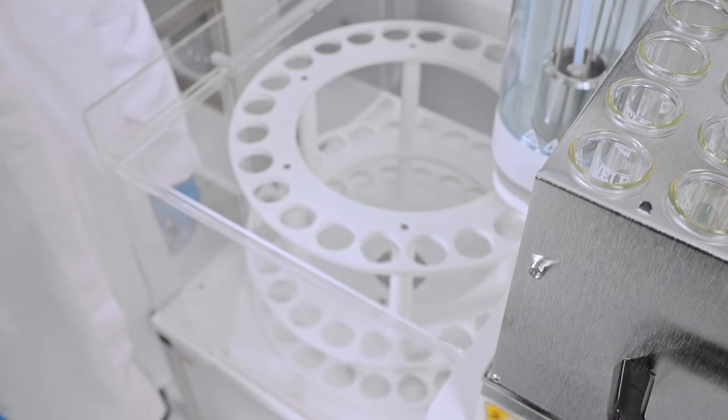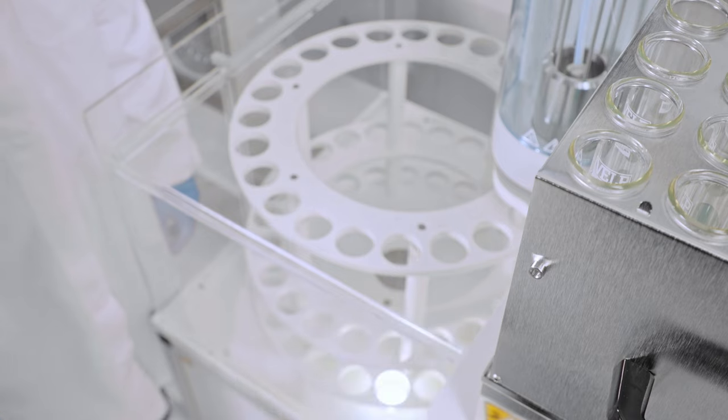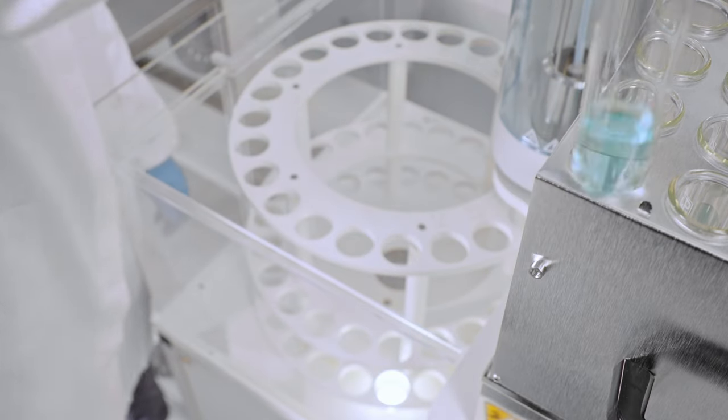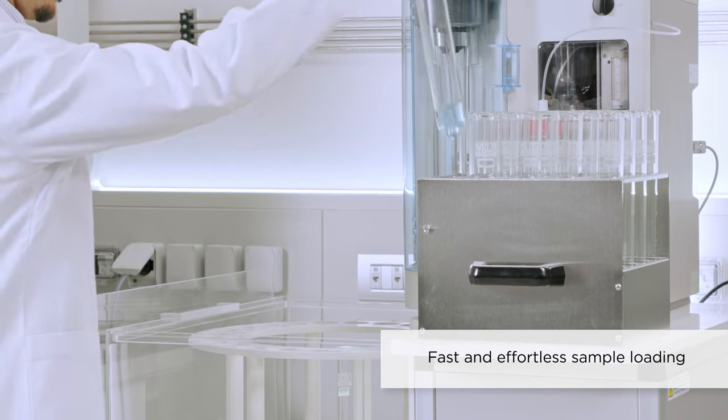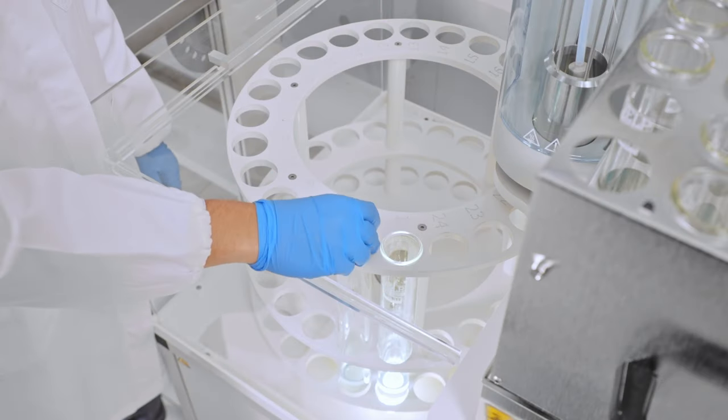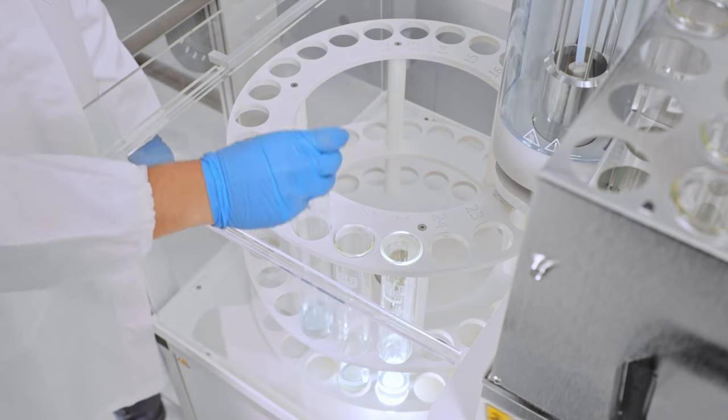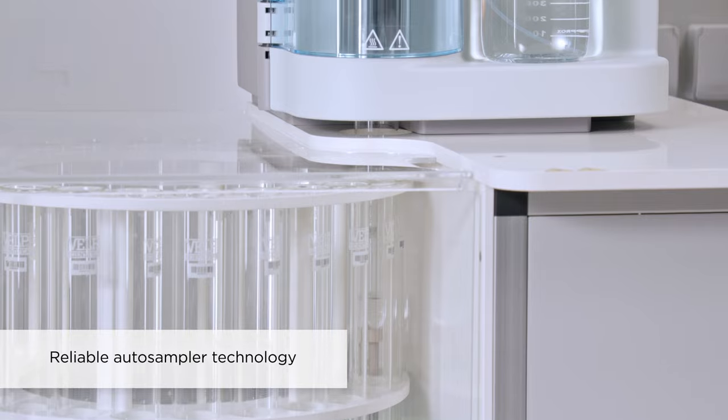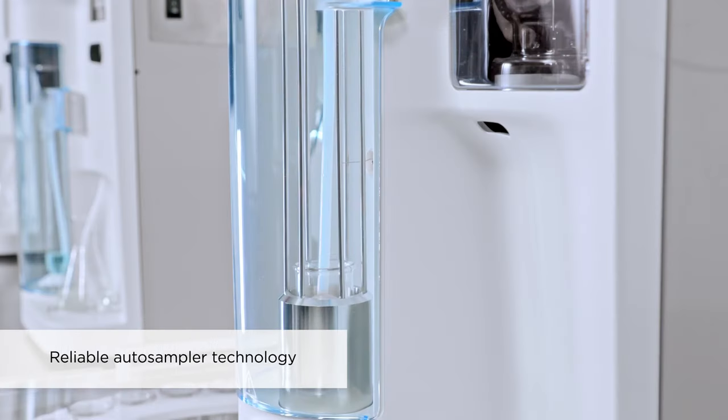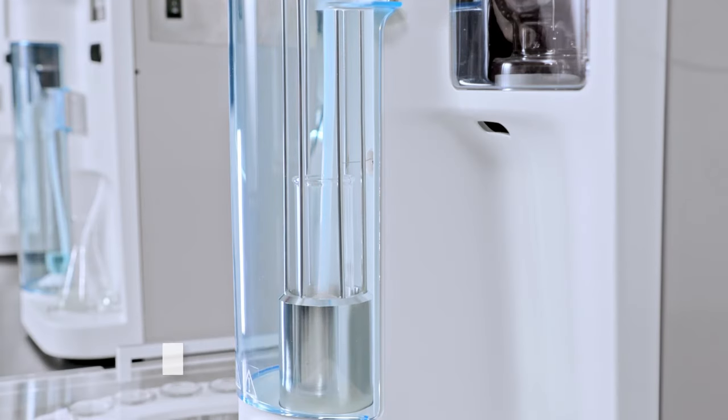When combined with the AutoKjel AutoSampler, it requires the lowest operator time for Kjeldahl analysis. Sample loading is fast and effortless, with a light showing where to place the test tube. The reliable AutoSampler technology drives the test tubes from the carousel to the UDK169.